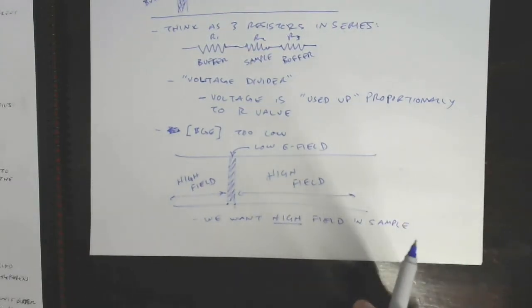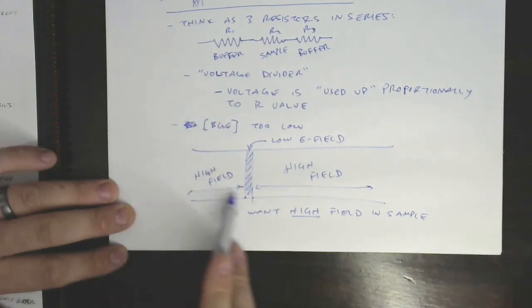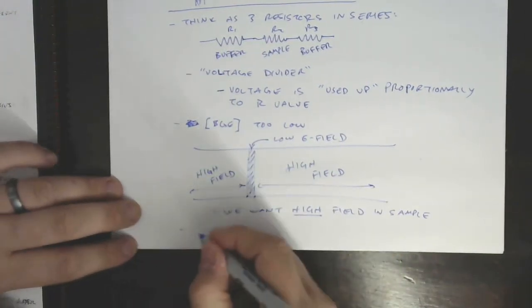So often, I guess we should really define this term right here, stacking. This situation is not stacking, this is destacking. Stacking actually is a good thing. So let's define stacking appropriately.